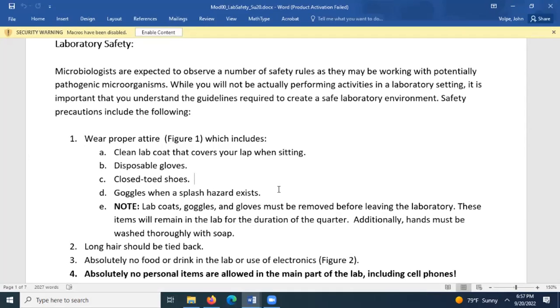Is that your hair tied back? Well, you could put on a hair tie to tie your long hair back. That is covered here as something that you put on for safety, kind of. You put it on for other reasons, but when you're going into the microbiology lab, it does help keep you safe. Pants. Pants? Yes, that's true. Clothes is all you needed to say, but pants would be correct. Okay, all right, so that's another thing.